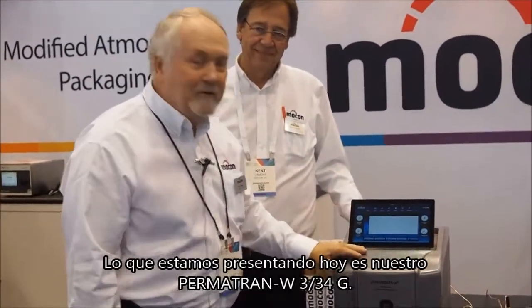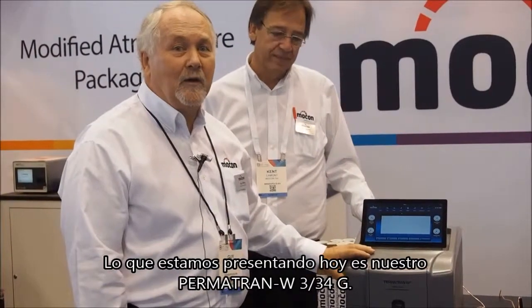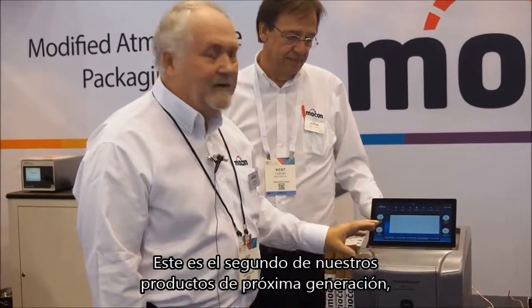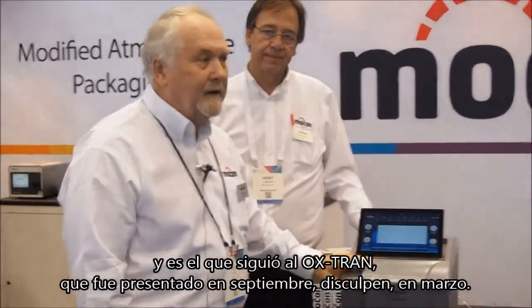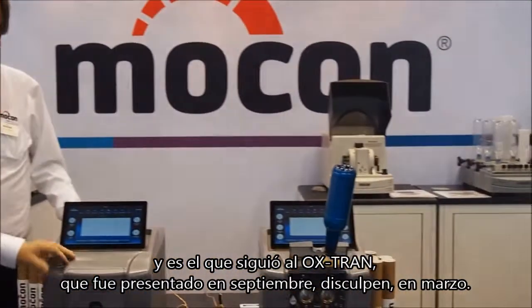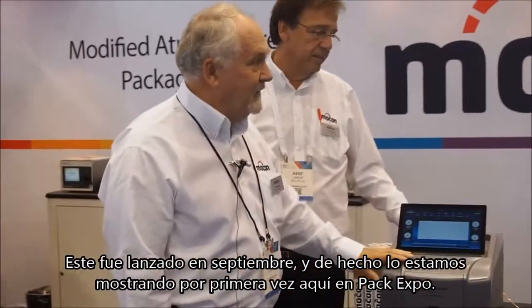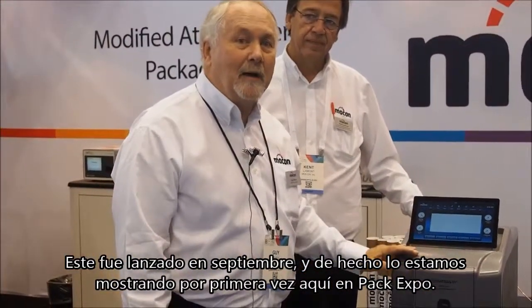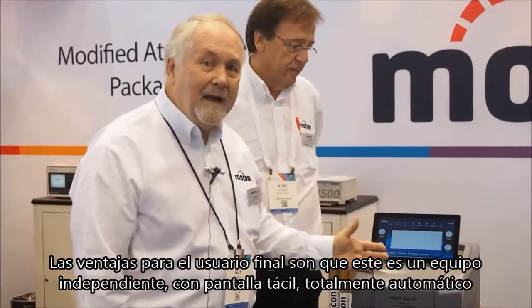What we're introducing here today is our new PERMATRAN-W 3/34 G. This is the second product in our next generation of products, following on the OX-TRAN which we released back in March. This one we released in September, and we're actually showing it for the first time today here at Pack Expo.